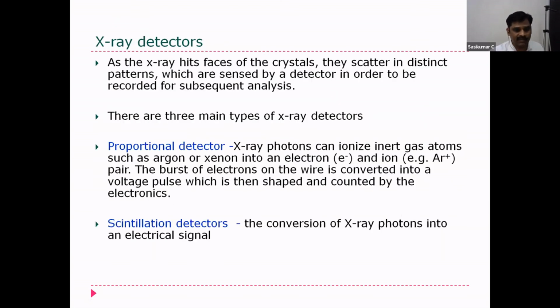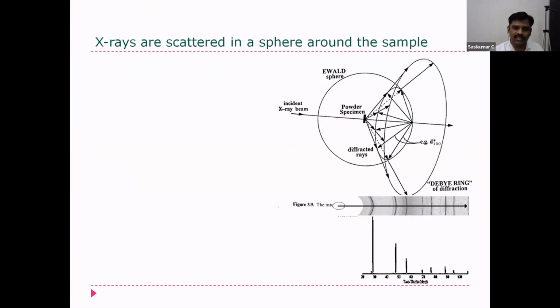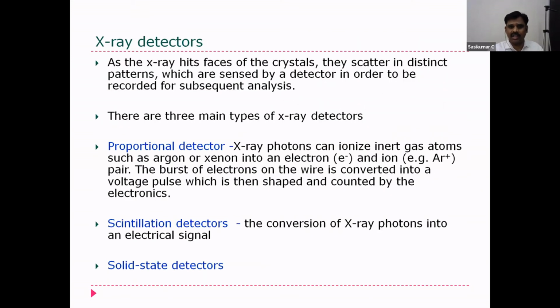And we use different types of detectors. In general, you have detectors like scintillation detector and solid state detector. In general, let me conclude in a way like point detector, line detector, and area detectors. What is this point detector? You have a silicon chip.